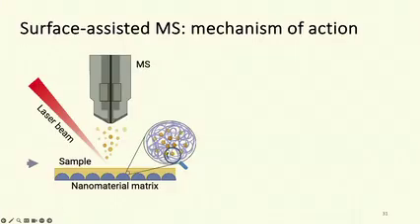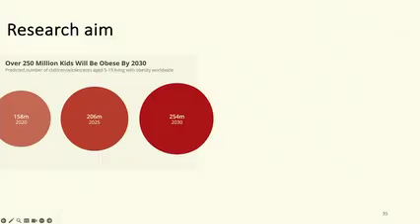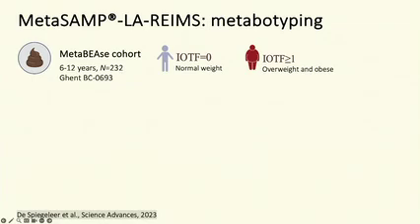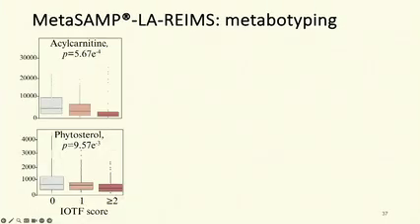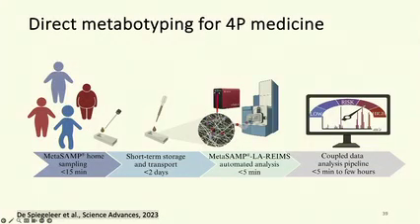We will skip that part. I will just tell you that there are a lot of nanoparticles both in REIMS and in paper spray ionization that can enhance the output of your data, so be aware of that. Check the recent publication.